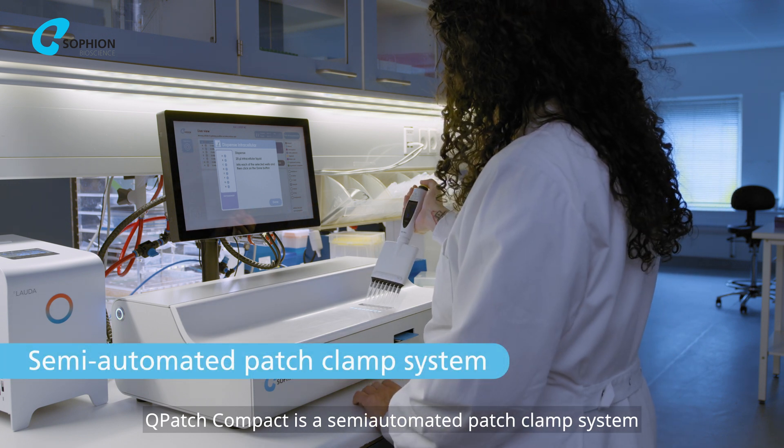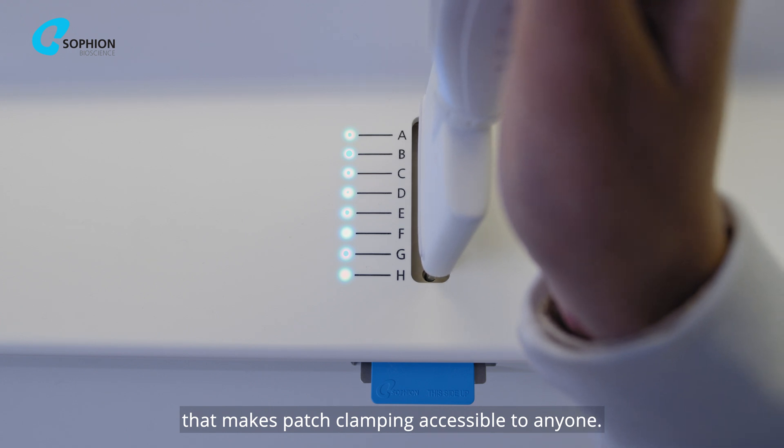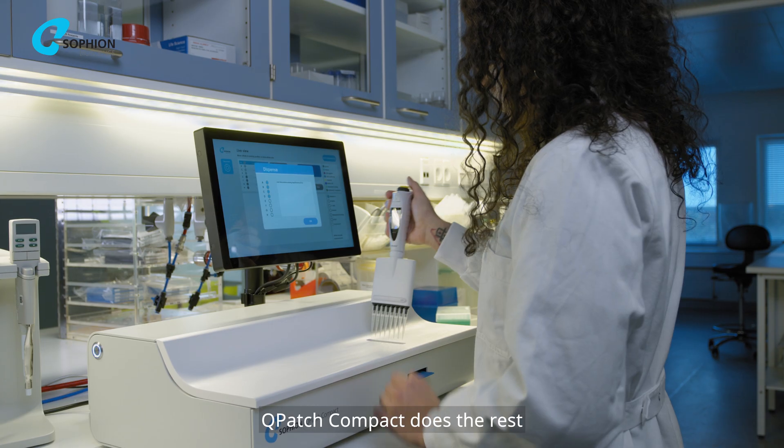Q-Patch Compact is a semi-automated patch clamp system that makes patch clamping accessible to anyone. You do the pipetting — Q-Patch Compact does the rest.